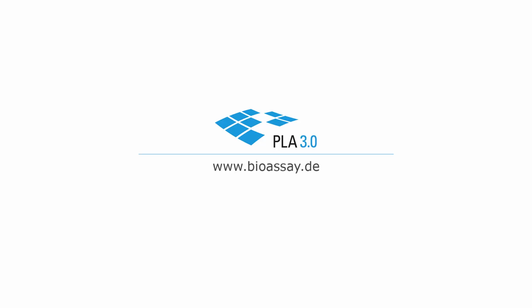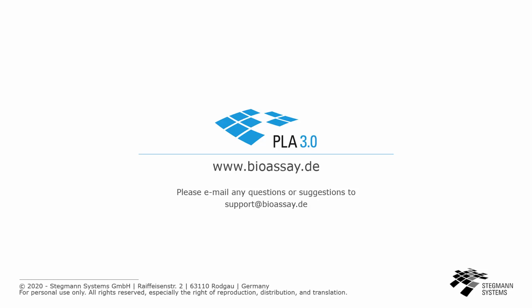Enjoy your first steps in PLA. If you want to know more about PLA databases, please consult our help pages.